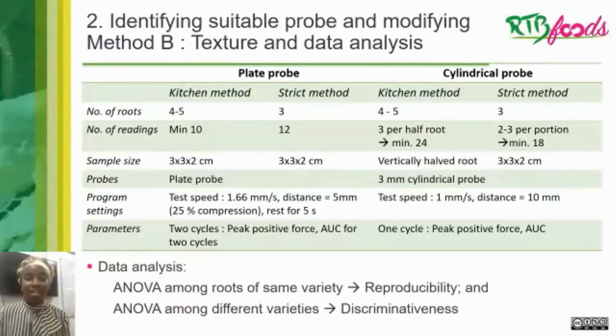On this slide, I just wanted to give more information in regards to the number of roots, number of readings, sample size, probes, program settings, and parameters that we used in all the different cases so that you'd have a better understanding of the different methods.